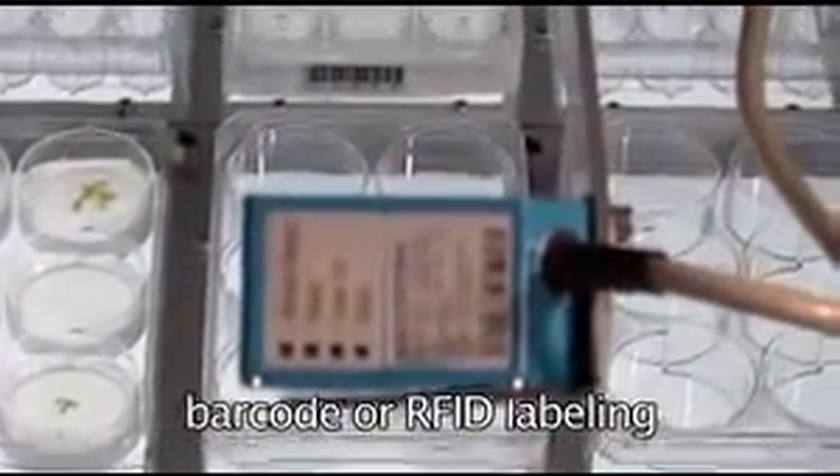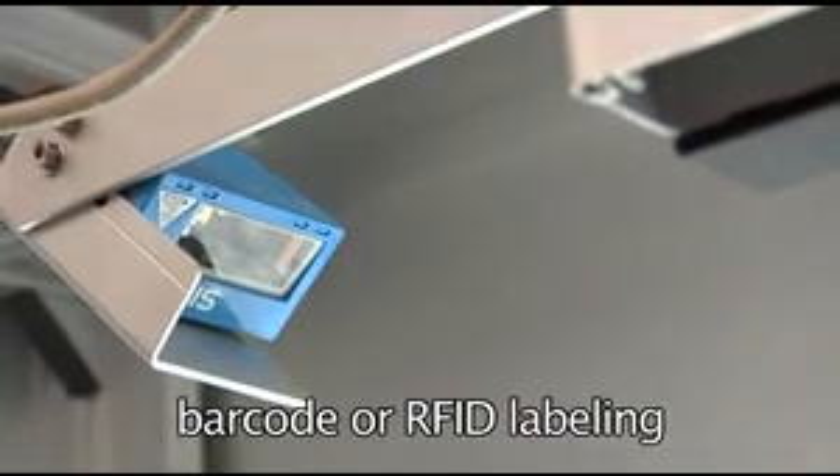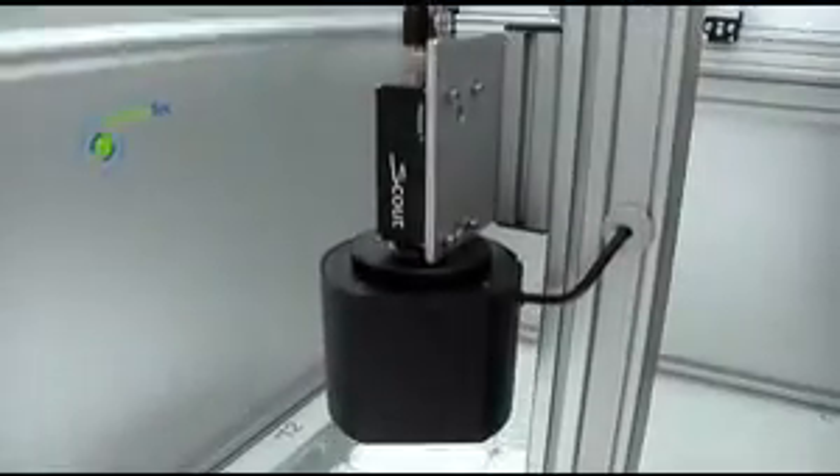Samples are identified by their barcodes and position within micro-titer plates or trays. Each well or sub-vessel is analyzed individually and the results can be correlated to experimental data.